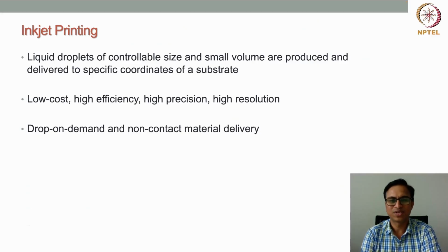Hello students, welcome to the course of organ printing. So till now we have discussed what is bioprinting, what are the different types of bioprinting techniques available. In this lecture we'll discuss inkjet printing technology or inkjet 3D bioprinting technology. Inkjet printing is a very common technology; in most of our offices we have printers, and some of the printers work on this inkjet principle.